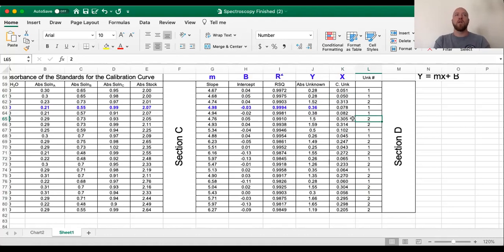It shouldn't be that unknown number one is between 0.045 and 0.102. It shouldn't be a range. It shouldn't be around something. It shouldn't be about anything. We are using an analytical technique. This gives us numerical values. We should be able to do mathematical calculations and statistics in order to come up with a single value. What is it supposed to be? We'll talk about error analysis and things like that later, but for now, I want a single value. What is that value?